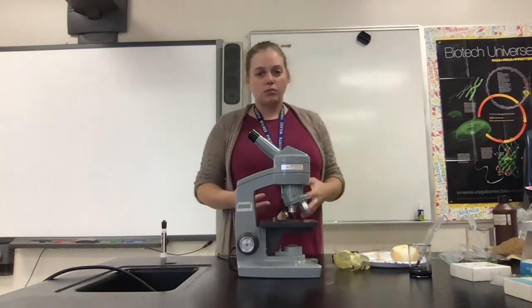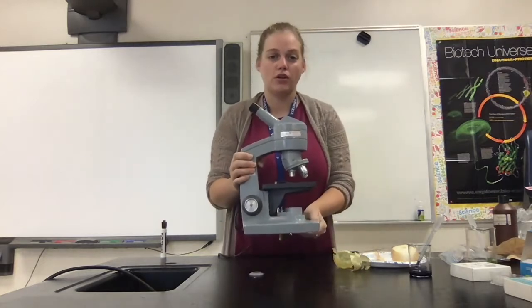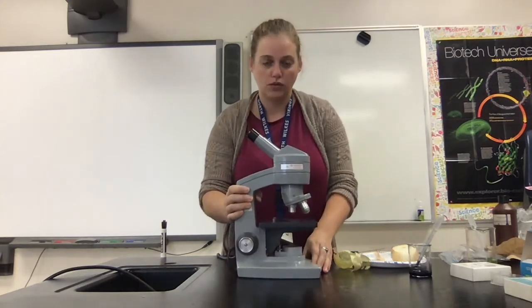So today, ladies and gentlemen, we're going to be learning how to use a microscope. Before we get started, let's go over some basic information about microscopes. All scopes are going to have an arm and a base, and this is how we're going to carry the microscope. You pick it up with both hands by the arm and the base. They're very expensive. We want to make sure that we don't drop them and damage them.